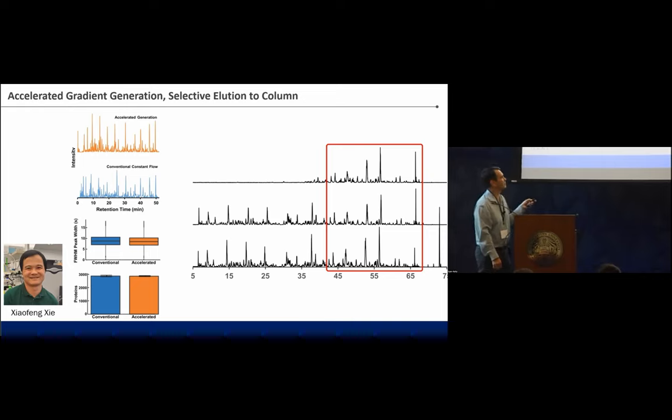And so, what I hope this shows is that it's possible to robustly operate at really low flow rates. It's not easy all the time yet, but I think it can get there. Thank you. I look forward to that time when it's easy and more accessible for everyone.